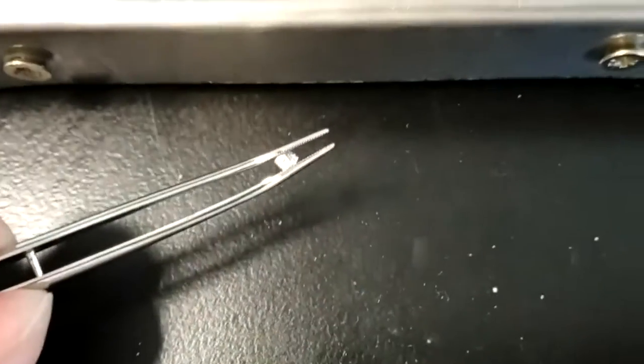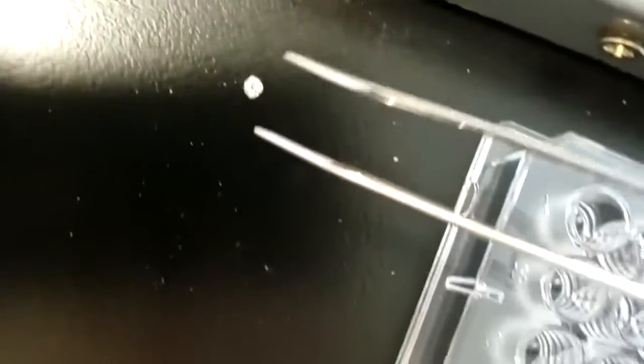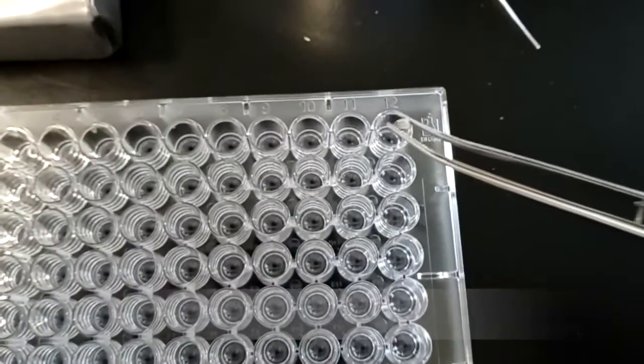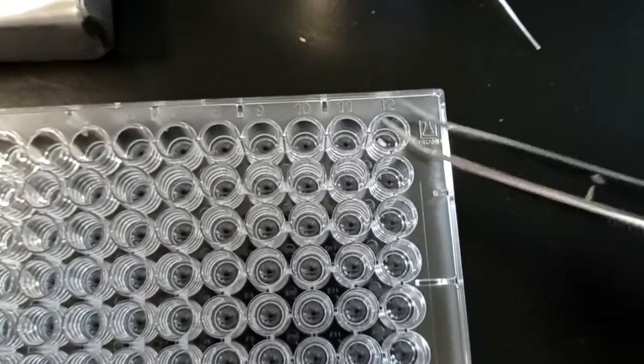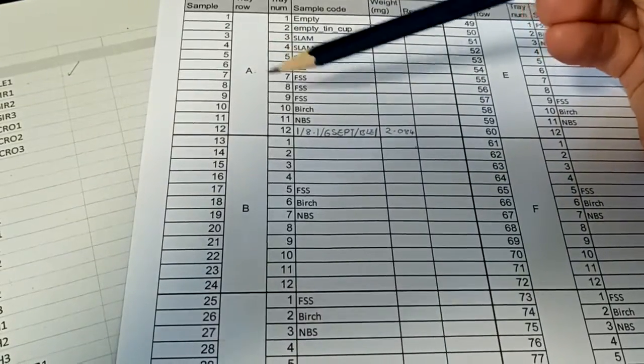Finally, using two pairs of forceps, compress your sample into a cube shape, making sure there are no sharp edges that may catch whilst it's being processed. The last step is to transfer your sample into the correct space on the sample tray and to double-check the recorded details for your sample. Thank you very much for watching and I hope this was helpful.